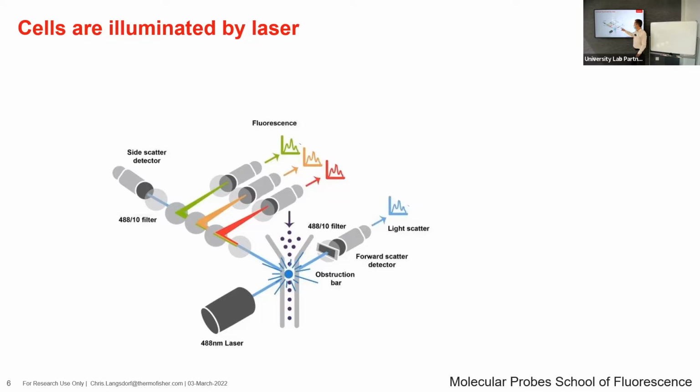But really, when we start to label our samples with fluorescent dyes, we can look at different channels, kind of like how a prism separates light into its different components, a rainbow of colors. We use similar mirrors that split light into its different colors, and we can analyze how much of each color is given off from each cell.